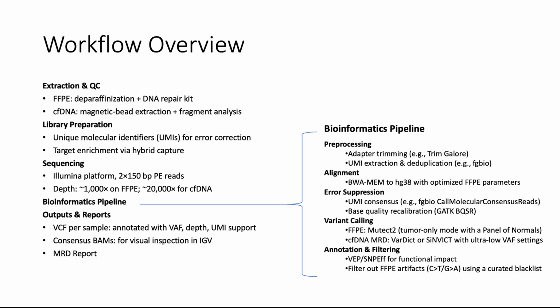And after that, when we have our reads, we can process them with our bioinformatics pipeline. So in this process, we will need to trim these adapters containing barcodes, identifiers, and so on. We will need to use deduplication tools to select the best reads, which will tell us what's the real sequence of nucleotides in this DNA.